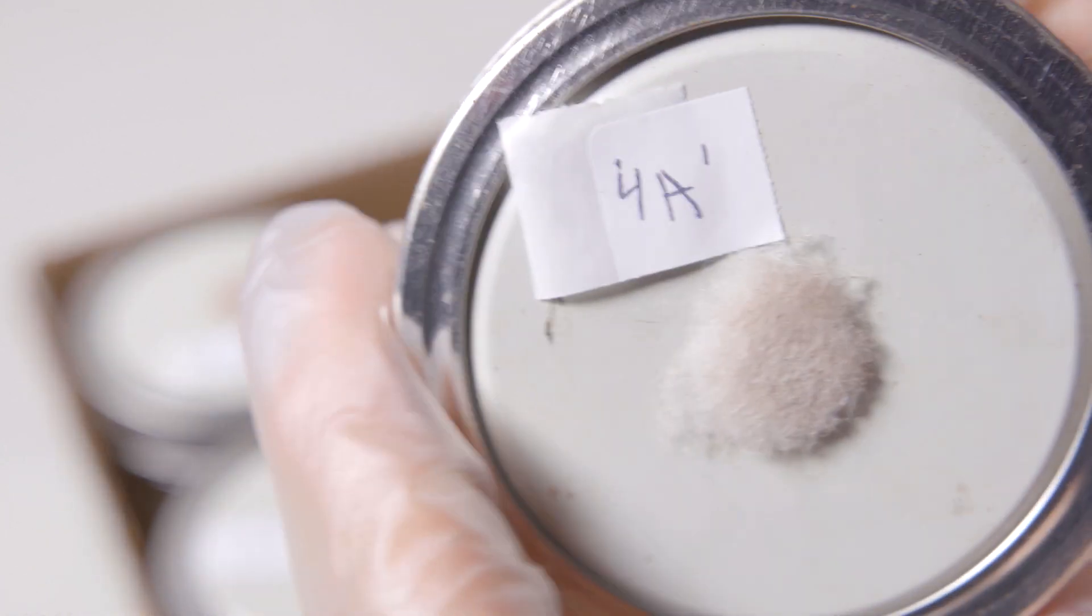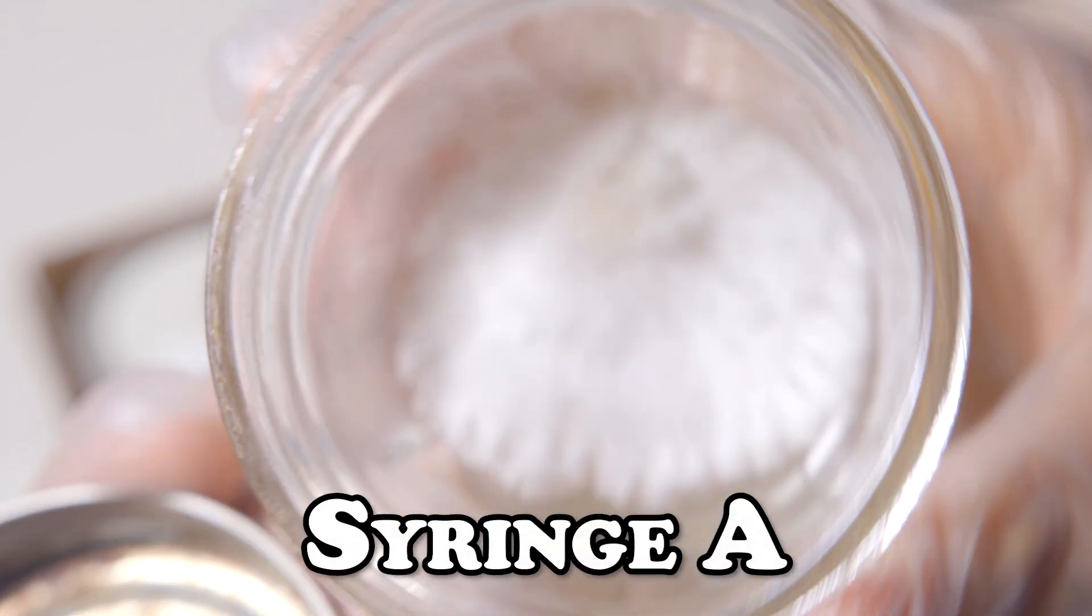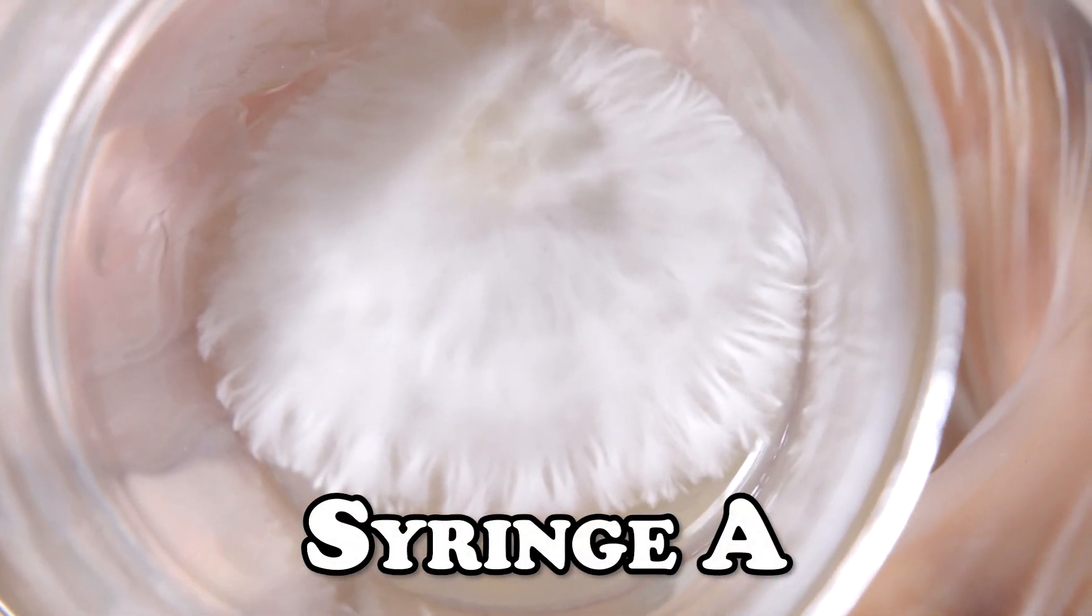As usual, we're going to start off with our first plate in set A. I would say this culture is solid. It's about colonizing the entire plate in only a week. I'm happy with this one.